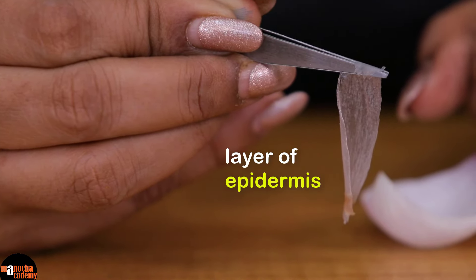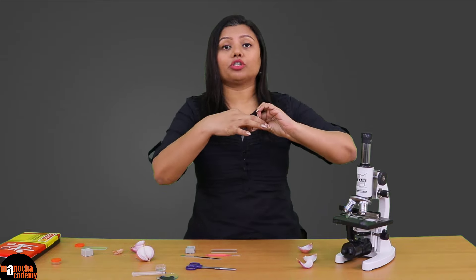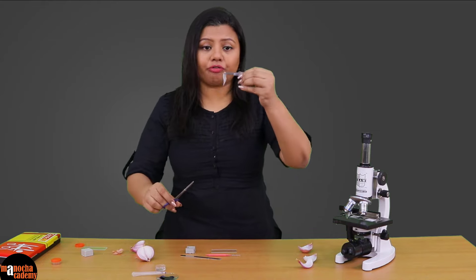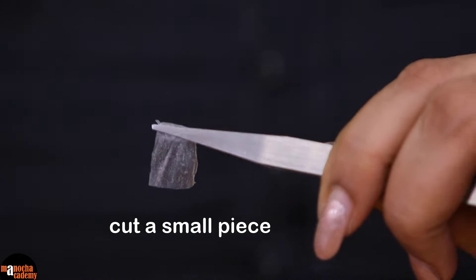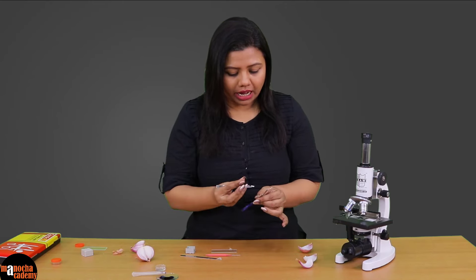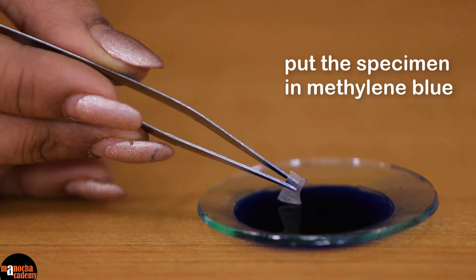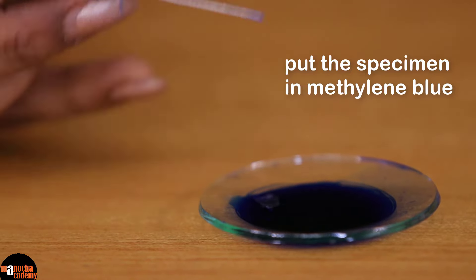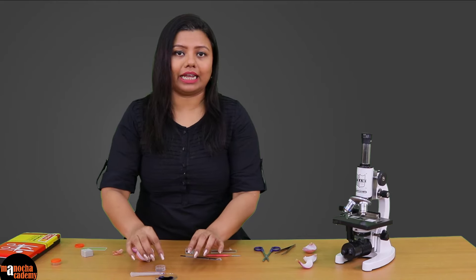However, we do not require so much. Everything has to be done very quickly because you do not want the cells to dry up. So very quickly I will take a small piece of this peel — this much is enough, in fact more than enough. I will put this in the methylene blue stain that I have taken on a watch glass. Depending on the strength of the stain, you might have to keep it for a couple of minutes to 5 minutes.